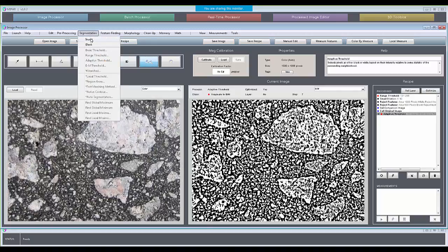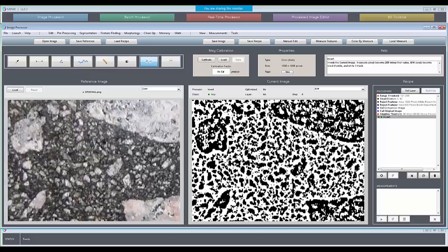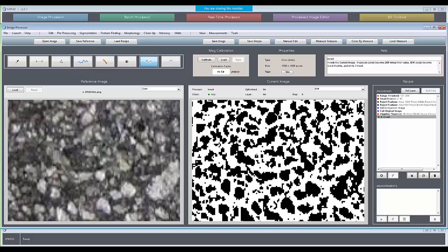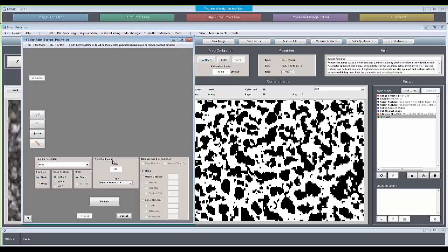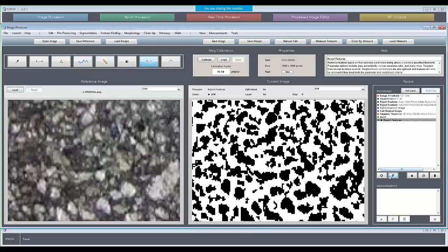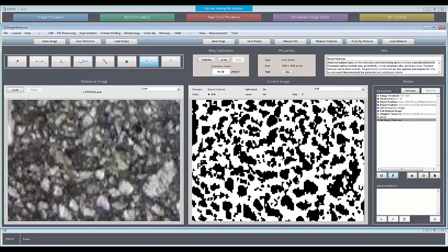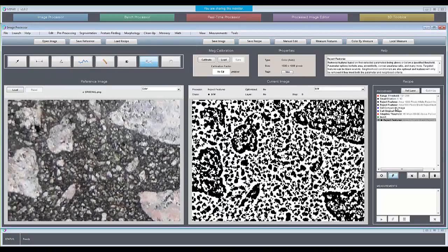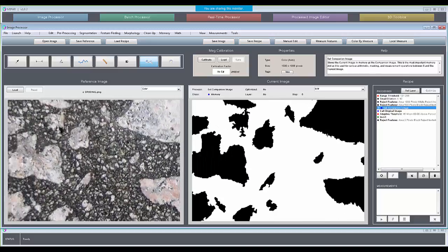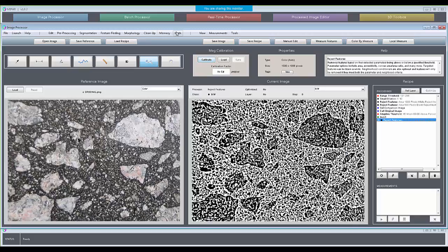And now we're going to flip this around. Let's get rid of features that are just under 5 pixels. Maybe just 2 pixels. I'd say if you're 2 pixels or less, I'm not going to count you a particle. And now we can add the companion image, which was our chunkier ones, to this state of the recipe just by doing a merge darker.